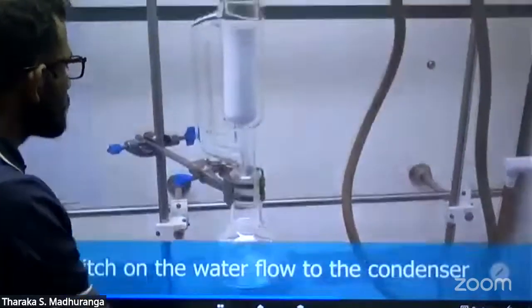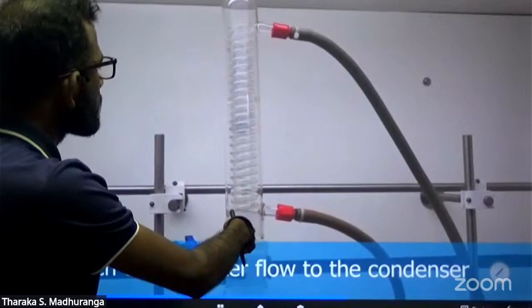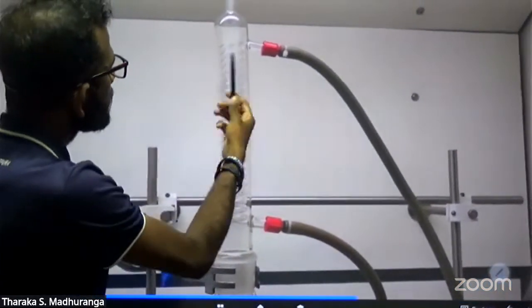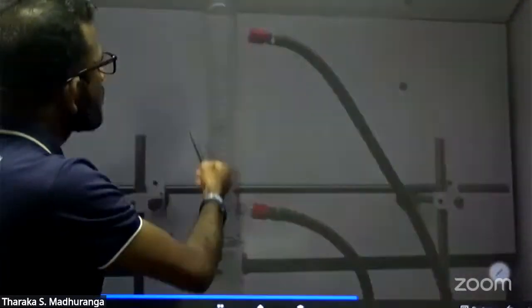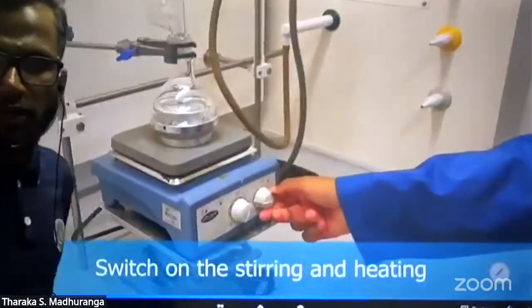Then we switch on the water. Now you can see water is filling the condenser and the additional water goes out from the condenser.